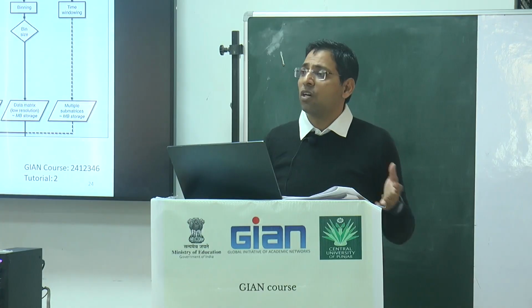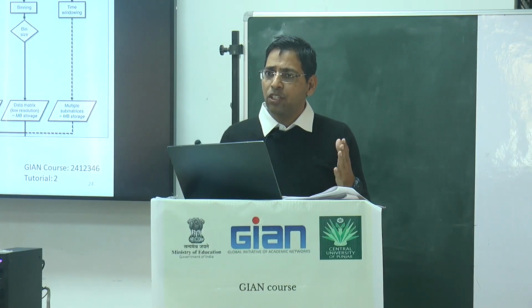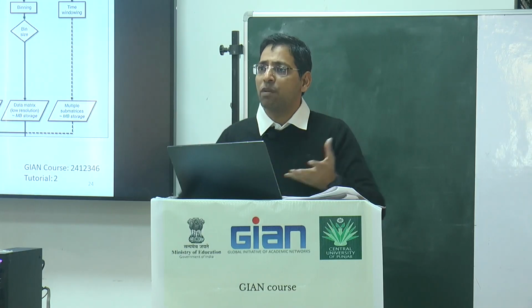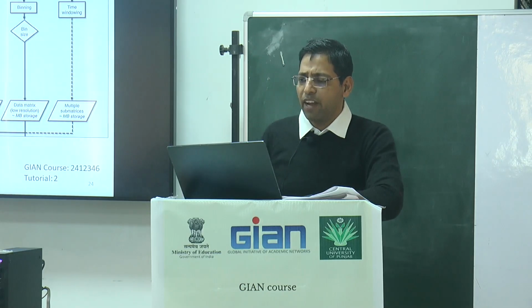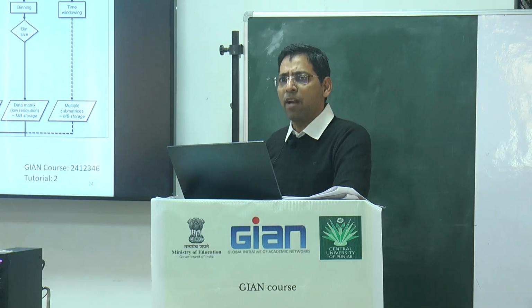अब साइज इतना बड़ा होगा तो मशीन ही नहीं कर पाएगी उसको एनालाइज, और वो इतने कम्प्लेक्स होते हैं, एक चीज़ को आप यदि डिफाइन करें अलग अलग एंगल से तो you will get so much enormous information about those metabolites. We need only just a few parameters, so we reduce. So when you reduce, we are using those data compression techniques to reduce the size and facilitate the efficient processing.